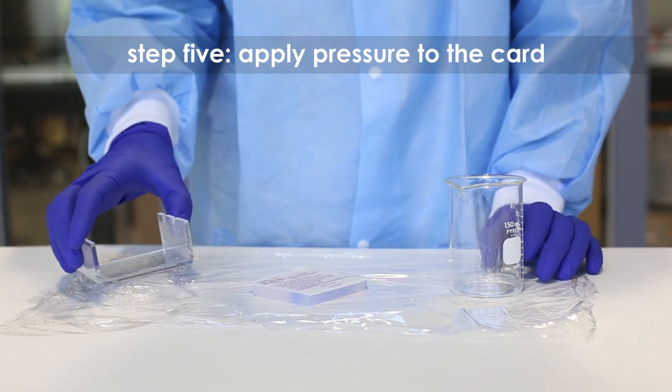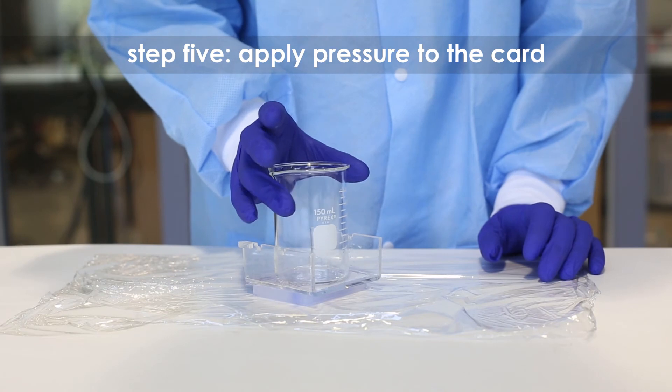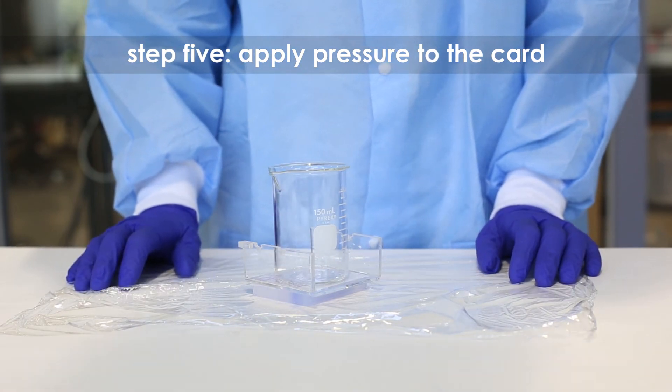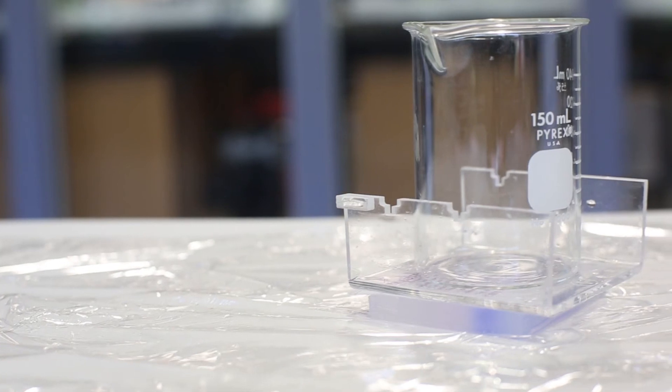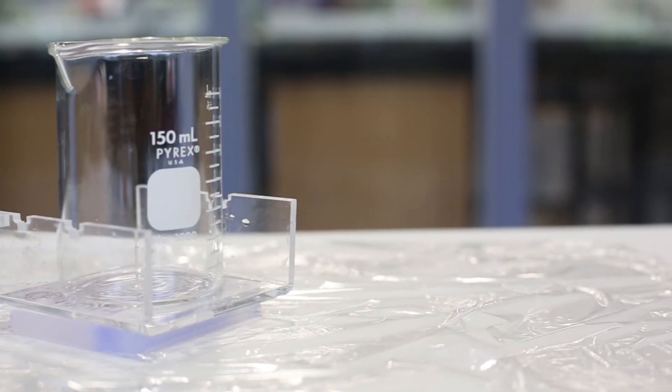Step 5: Place the casting tray on top of the card. Place a small weight like an empty beaker on top of the casting tray to ensure that the instastain ethidium bromide card is in direct contact with the gel surface. Stain the gel for 3 to 5 minutes.